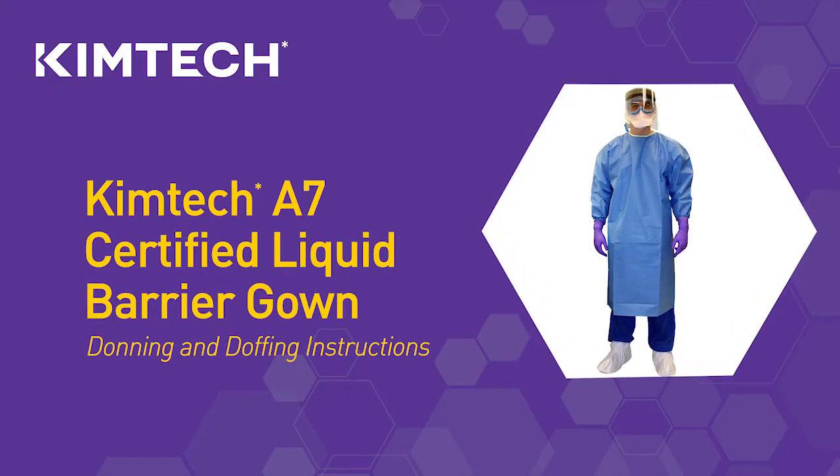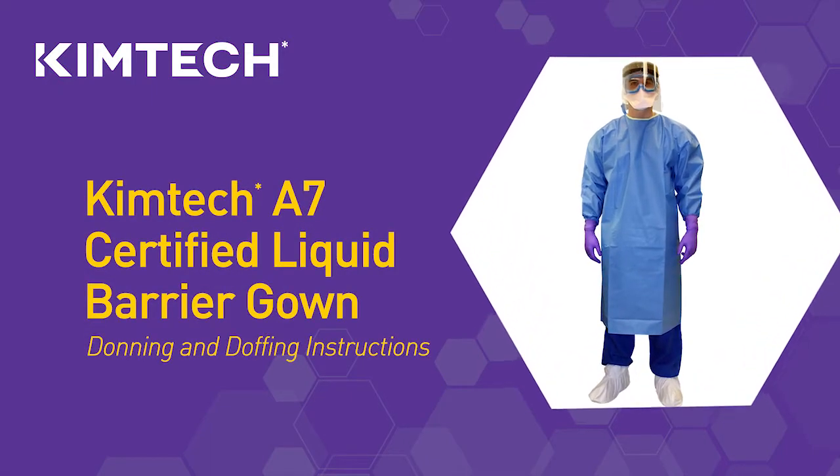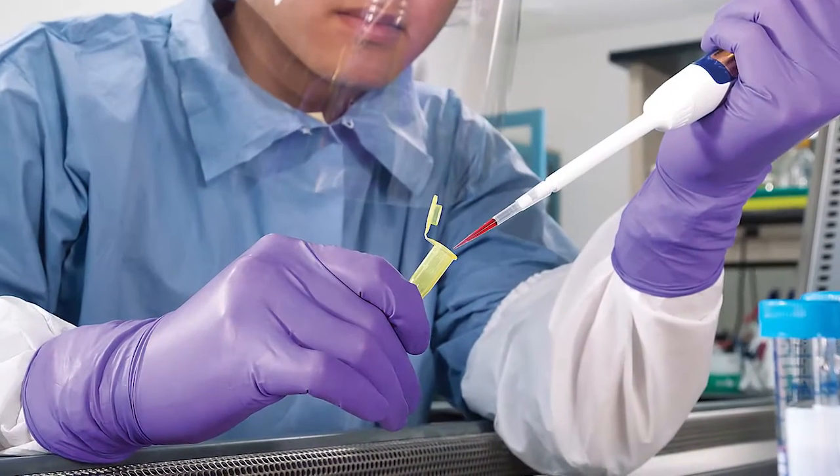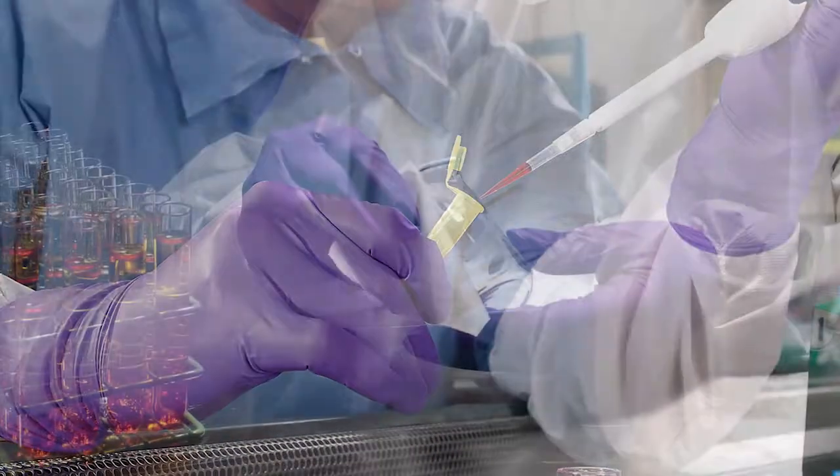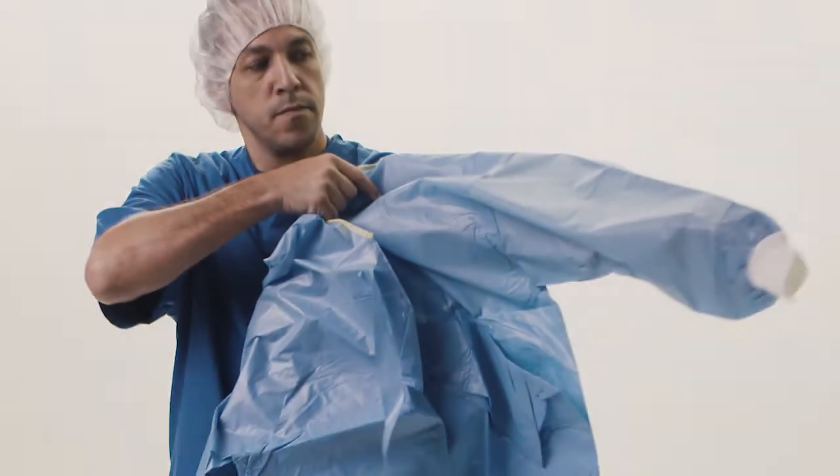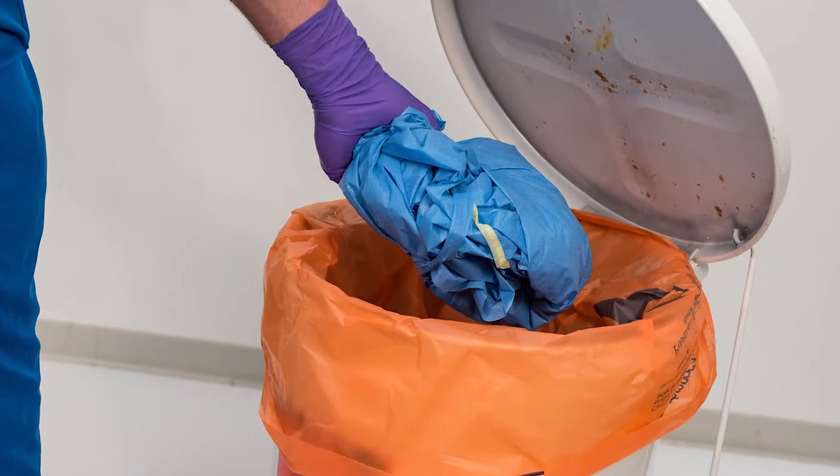The Kimtech A7 Certified Liquid Barrier Gown provides stringent barrier protection for your facility. It guards against spills and splashes from blood-borne pathogens, biologics, and other harmful liquids. And it's easy to put on and take off to reduce contamination risk and prevent liquids from getting on your skin.